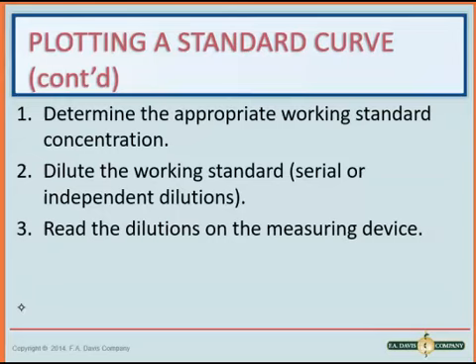And then you're going to dilute the working standards, and they can be serial or independent dilutions. Again, you might be making up your working standards, or they may come pre-made, and you can order them already diluted down to the concentration that you need.